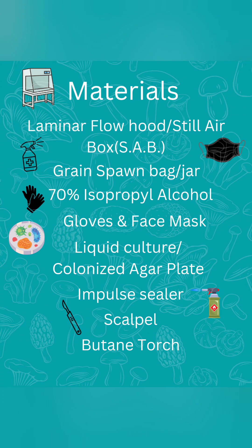To get started you'll need a laminar flow hood or a still air box to do your work inside of, your choice of grain spawn bags and jars, 70% isopropyl alcohol for sterilization purposes, gloves and a face mask, liquid culture or a colonized agar plate, an impulse sealer if you do not have an injection port, and a scalpel and butane torch if you will be using agar.